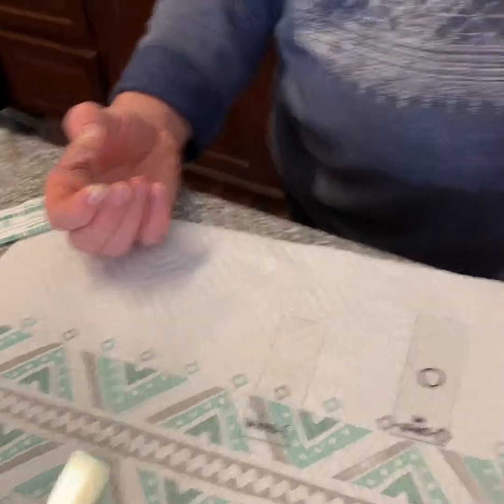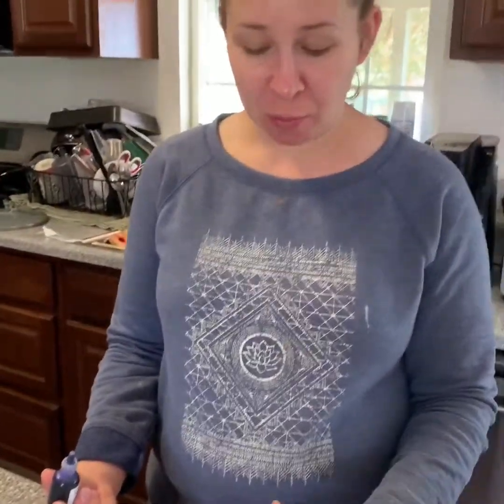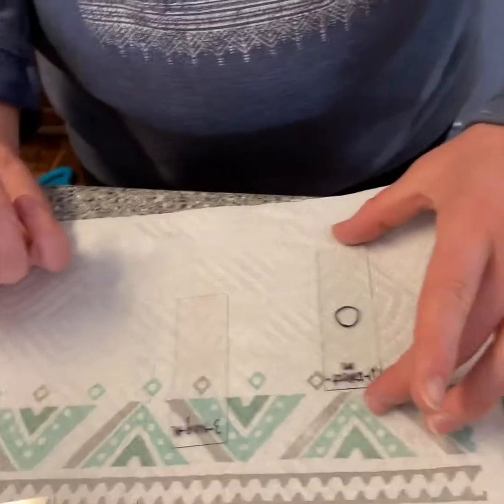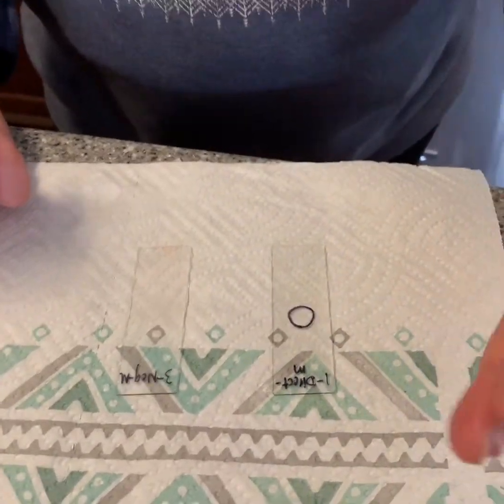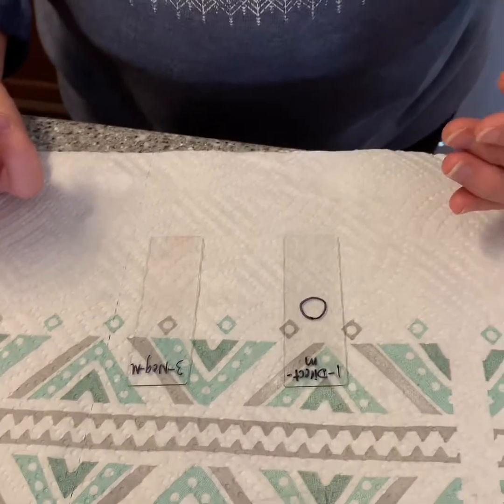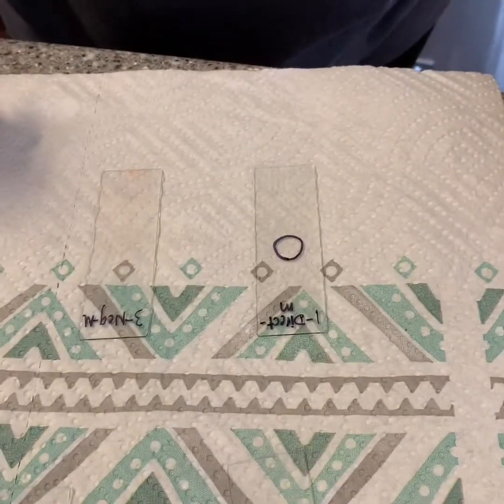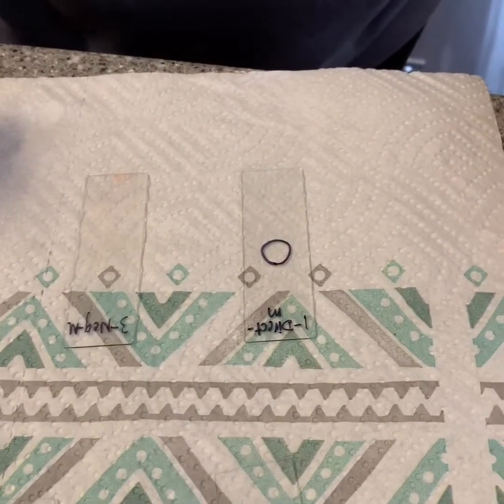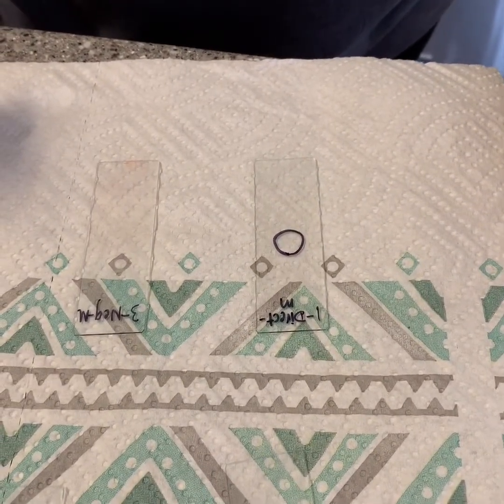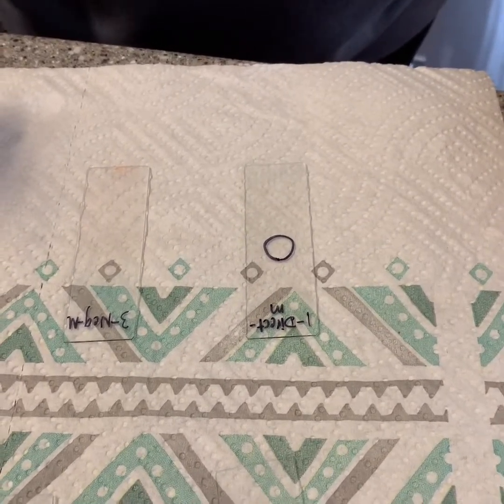My slide is now smeared and I'm going to let that air dry. My direct mouth slide has now dried and I'm going to put one to two drops of crystal violet right there, located in the center where my gum and mouth bacteria is, and I'm going to let that sit for 60 seconds.